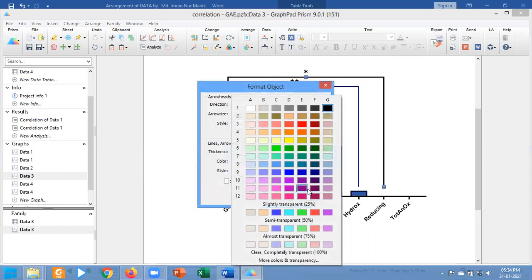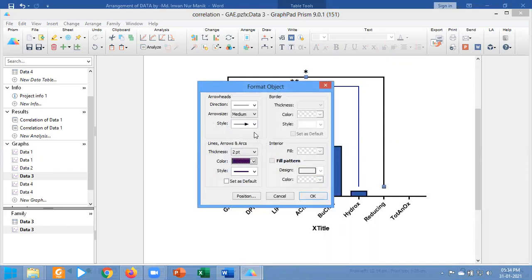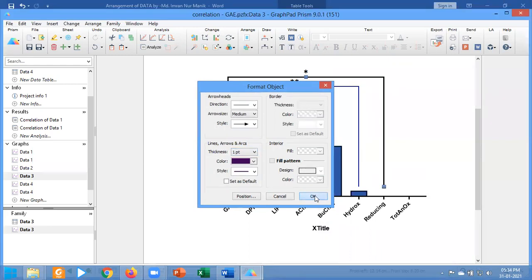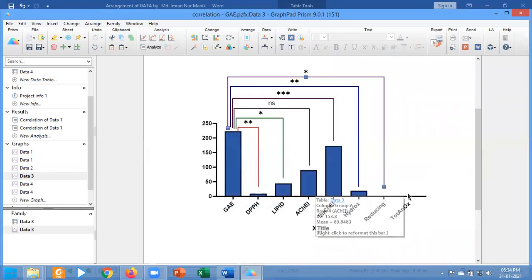I am going to change the color of this one and the point thickness. Okay, this has been done.